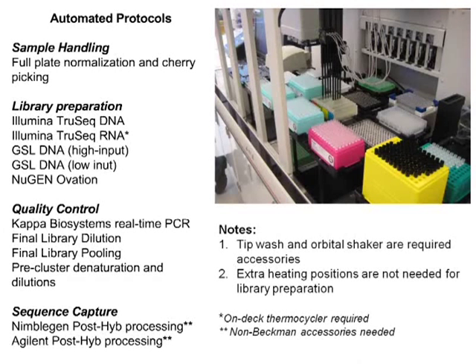A final housekeeping piece that I want to be sure I mention, and I have some slides later in the talk which will emphasize this, is we had begun the development of many of these automation schemes prior to Beckman releasing the SPRIworks HT methodology. Since that's been released, we've had an opportunity to test that, and I'll introduce some of those results as well as some comments on that particular solution a bit later.